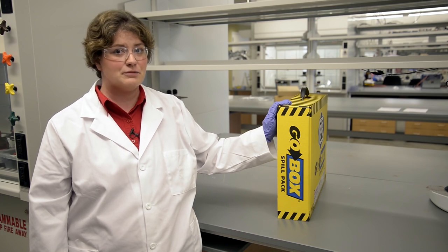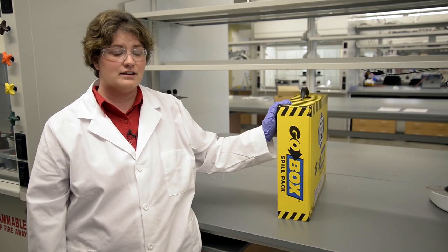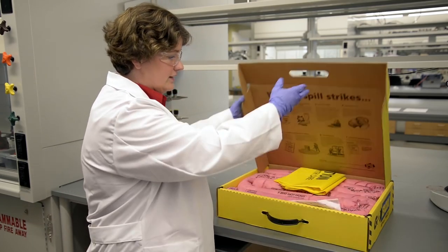If you do decide to clean up the spill for yourself, know where your spill kit is and know how to use it. I'm going to go over very briefly some of the items in the spill kit.